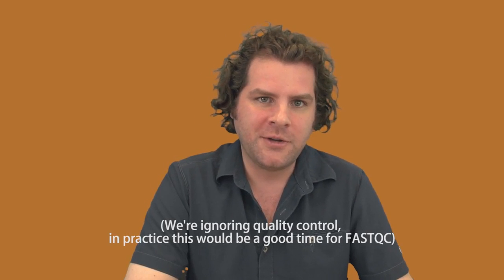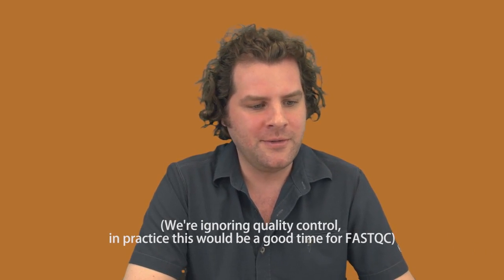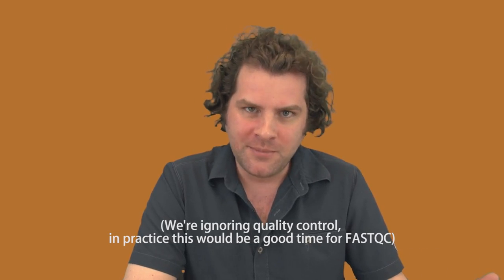So once we've imported all of the data from the data library, the first thing we want to do is map it. We're going to skip our quality control. If you want to look at doing quality control and verification, you can look at the previous lecture on FastQC. This would be a natural time to do that, but we're going to forge ahead. And so what we're going to do is use Bowtie2 to map our data onto the mouse genome.